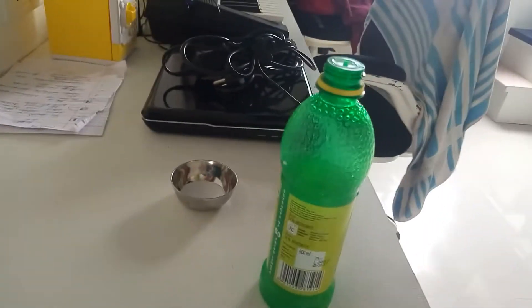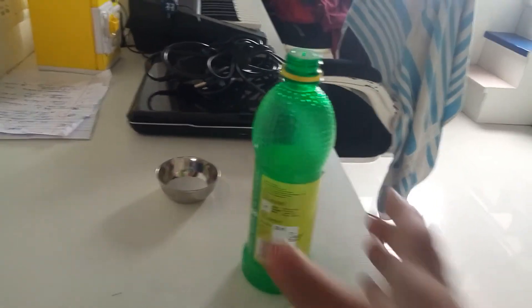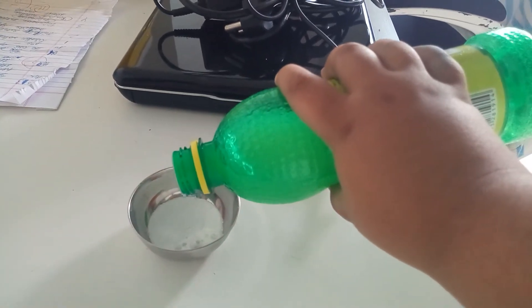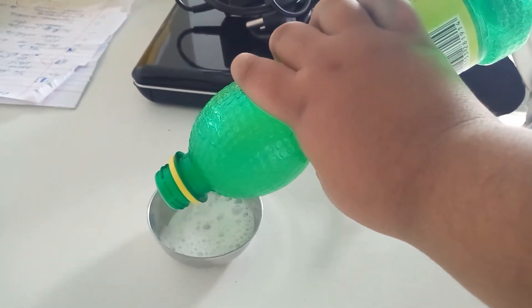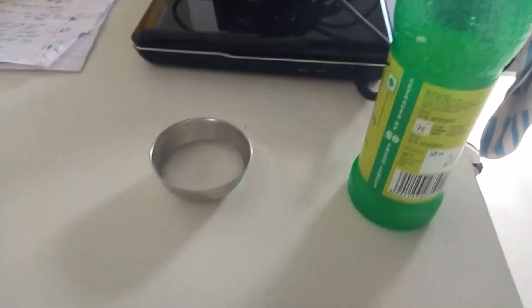We will start by adding the acid to the soda. There will be an acid-base reaction and carbon dioxide gas will be produced.